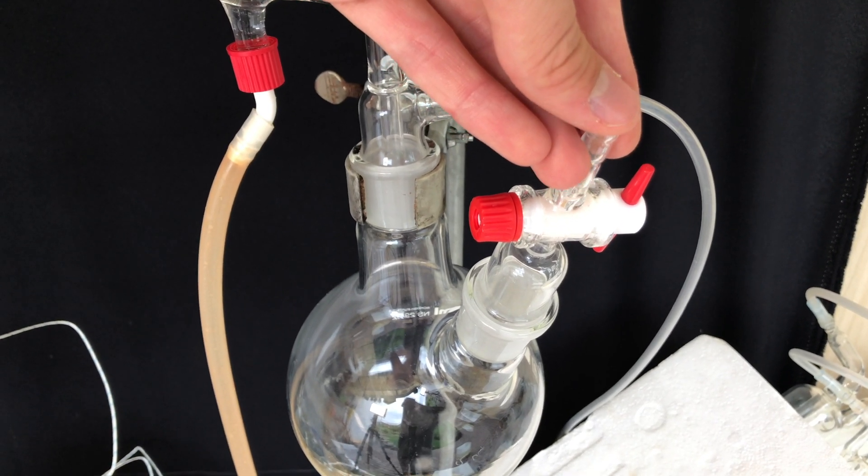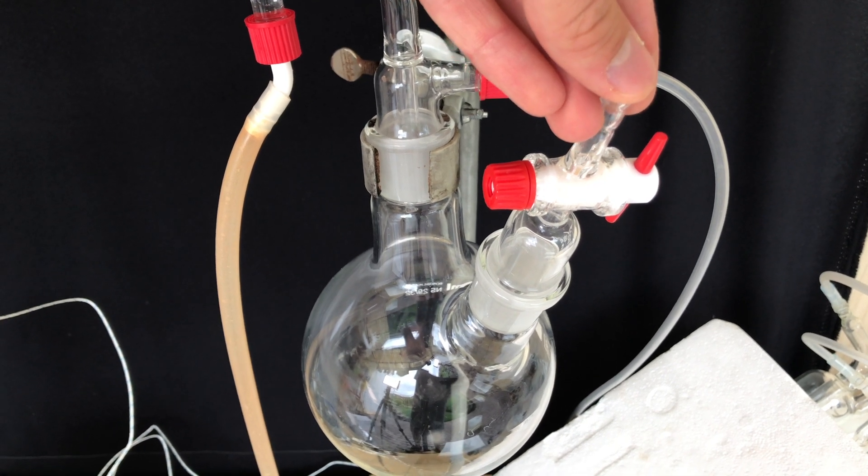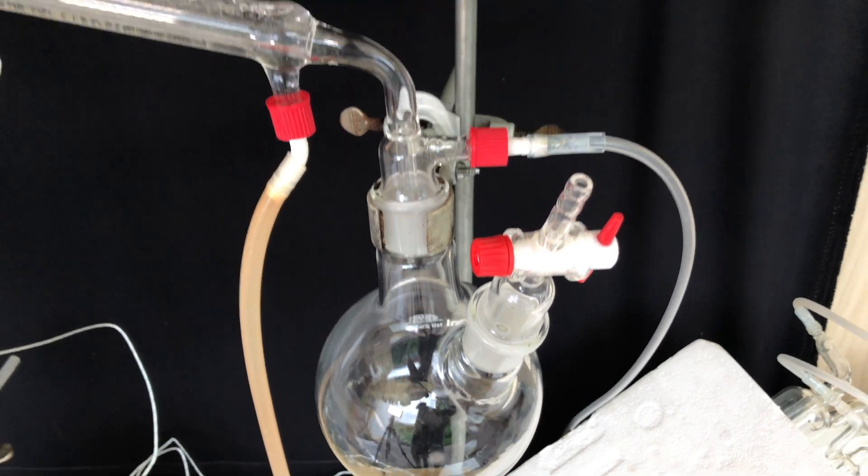There are going to be extreme bumping issues with the vacuum distillation in the beginning. You want a quick way to vent the system and therefore we use this two-neck round-bottom flask with this valve.